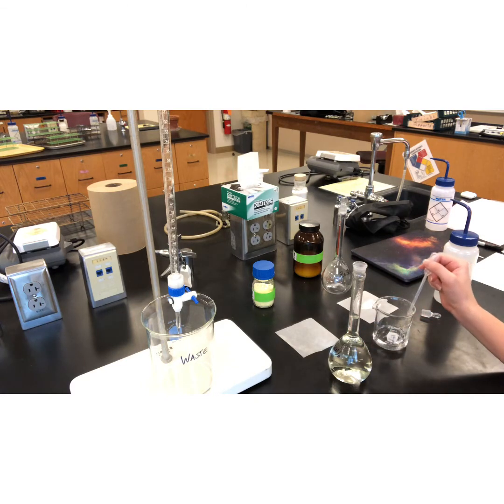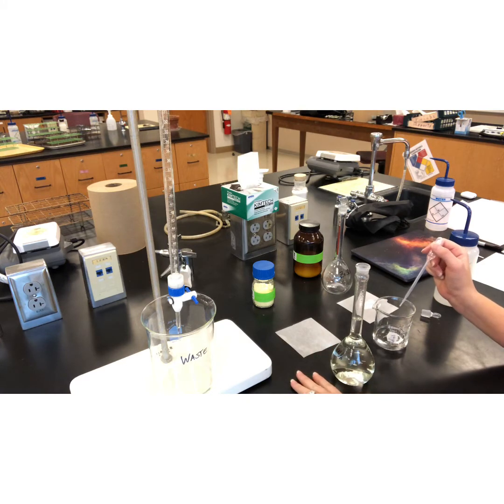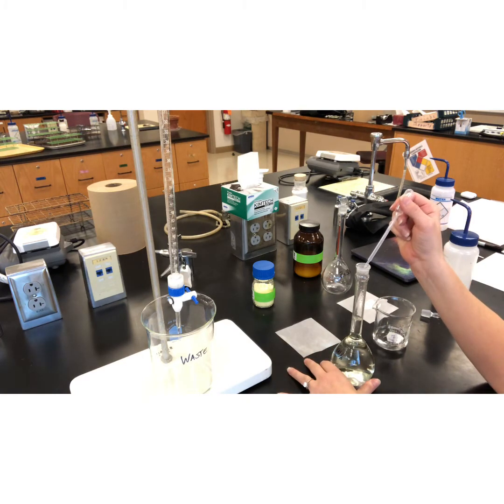So I'm going to come down here level so I can see the meniscus and squirt it in, taking it easier. Almost there. Quantitative chemistry is definitely about a lot of patience and being very particular and precise with your measurements. Very precise and accurate. Drop, drop, drop. One more. One more. There we go.